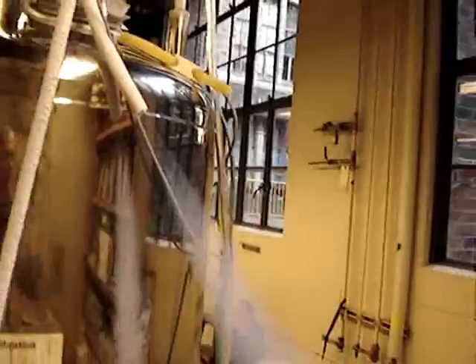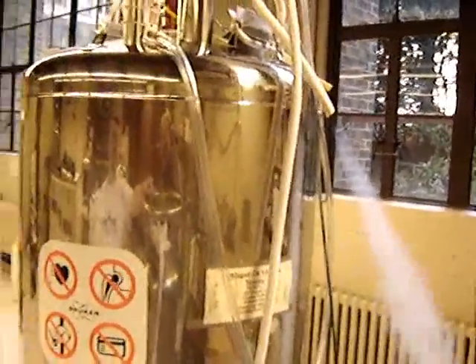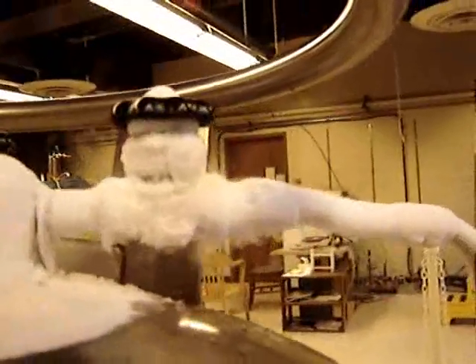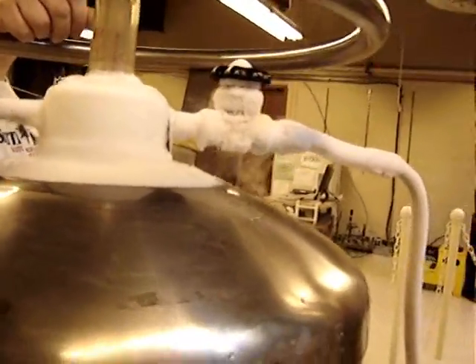Tourist mode. Let's see where I can get there. You can see the white water mist coming off of it, and then the blue. I don't know if the color balance would be good enough to pick it up — I don't know if it's going to be able to reproduce on a camera like that. And then there's that right there. It's hard to see up against the background.